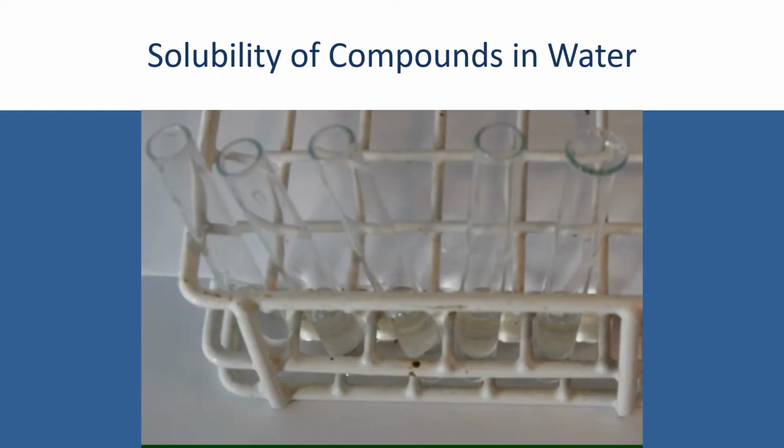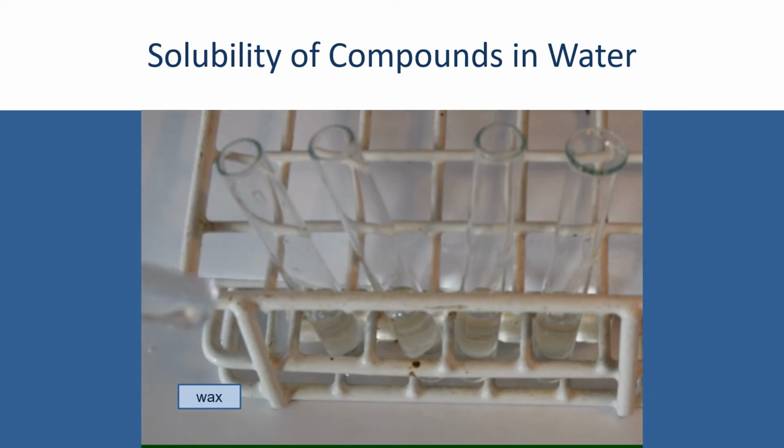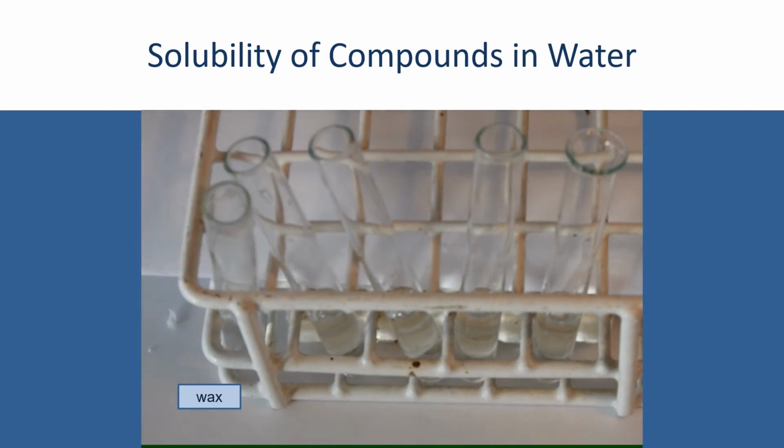So in this experiment we want to look at the solubilities of various compounds in water. I'm going to start off with looking at some wax. Wax, as you know, contains only London dispersion forces between the molecules. So if I add some wax to the water there and give it a little shake, we can see there that the wax is insoluble in water.